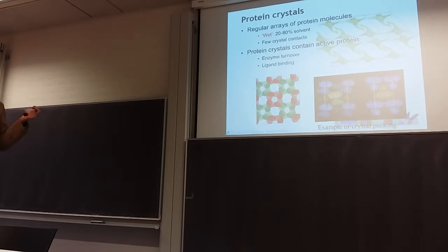The other thing is that you can then actually make a structure with the ligand bound in it. And if you're doing medicinal chemistry, you want to develop a new molecule to inhibit this enzyme or to activate this receptor or whatever. That makes a lot of sense. Yeah? You can actually study the protein-ligand interactions quite directly.